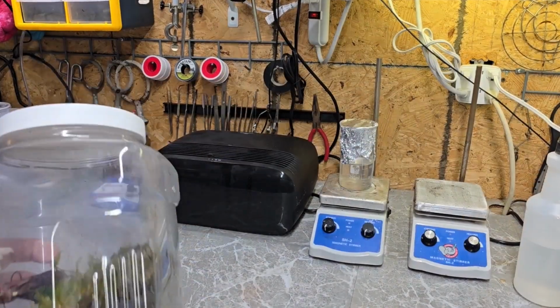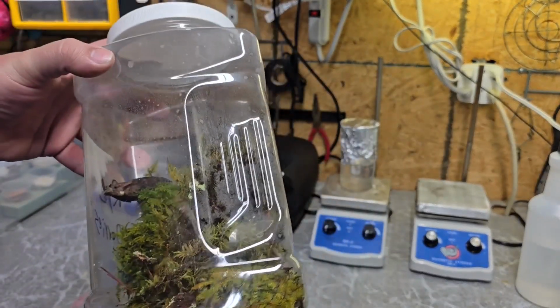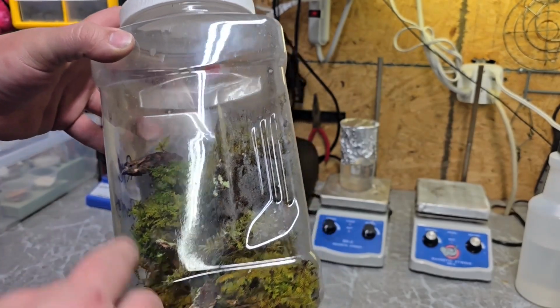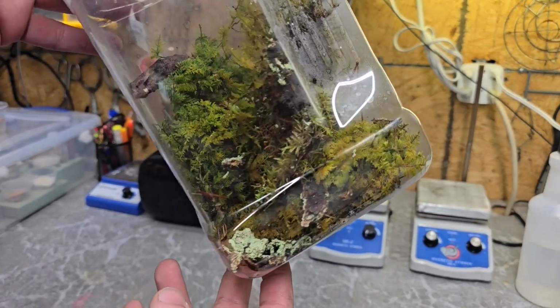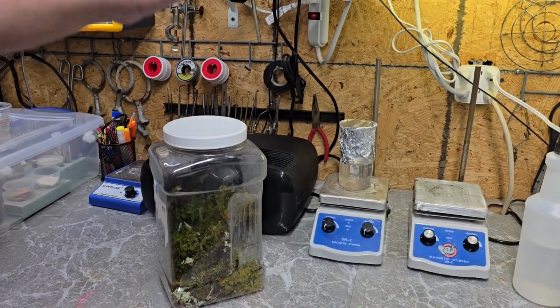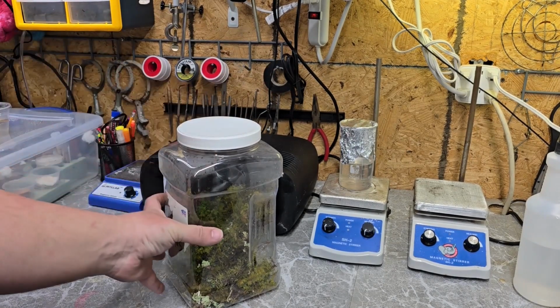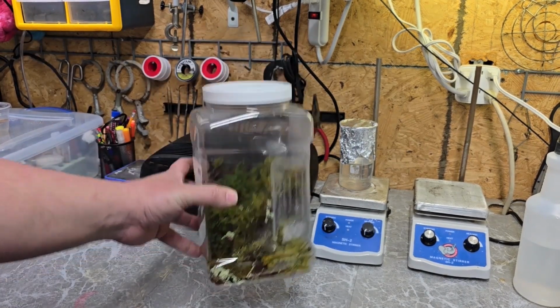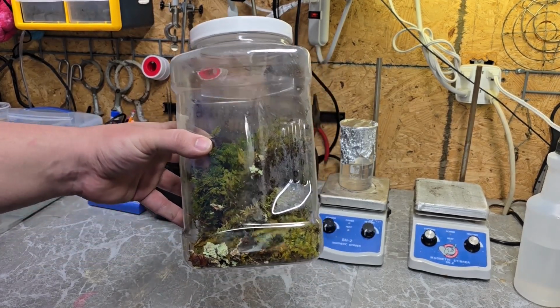All right, we're back in the shed, and we got our little container here that's not completely full, but containing our moss samples that we got, as well as the little samples of different lichens that we scraped off of a tree. Now, all we got to do in order to extract whatever is living in this moss, I'm just going to put a little bit of water in with this moss. I'm going to shake it up and really confuse whatever is living in this moss.